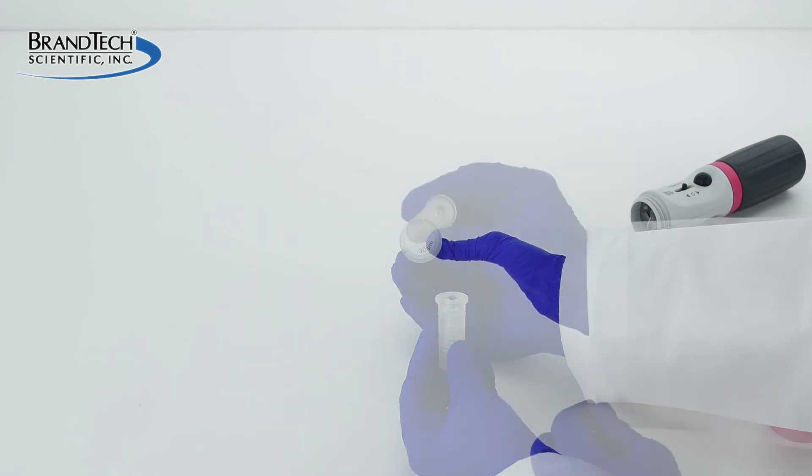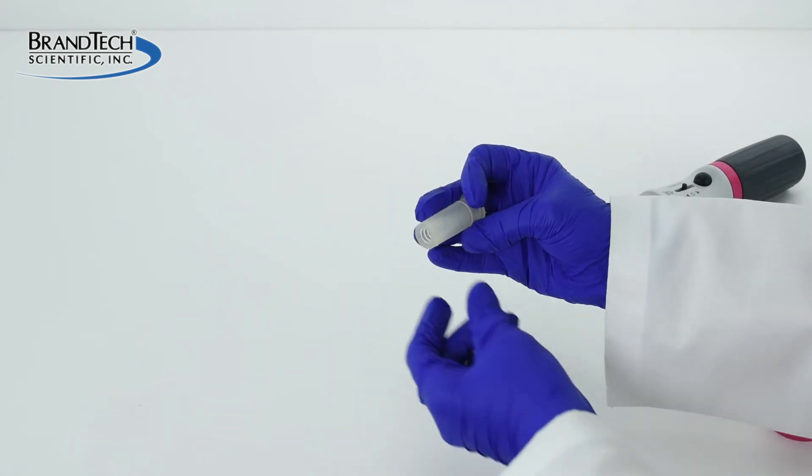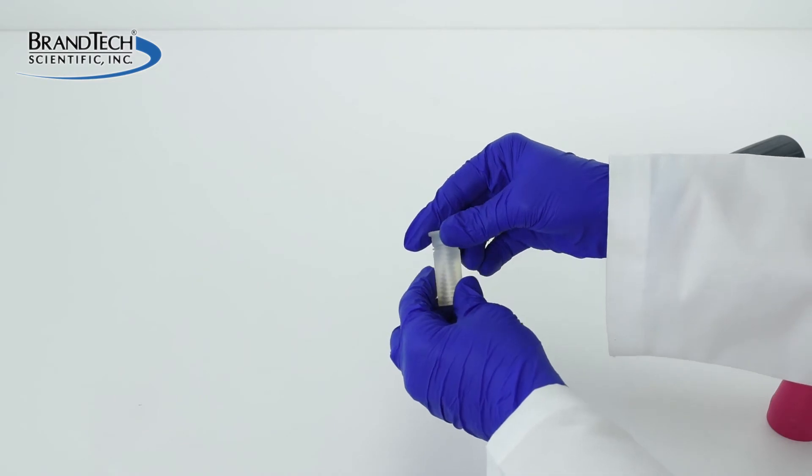Use this opportunity to inspect the silicone adapter for cleanliness or damage. Clean or replace if necessary.